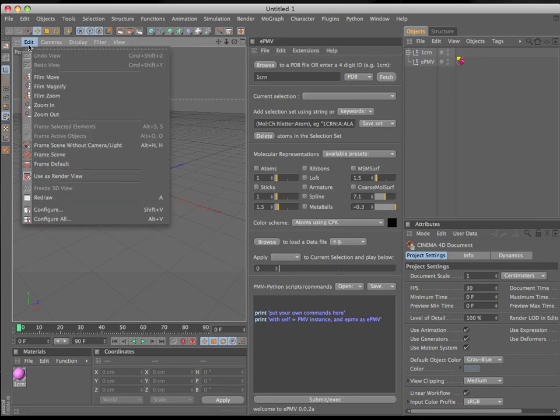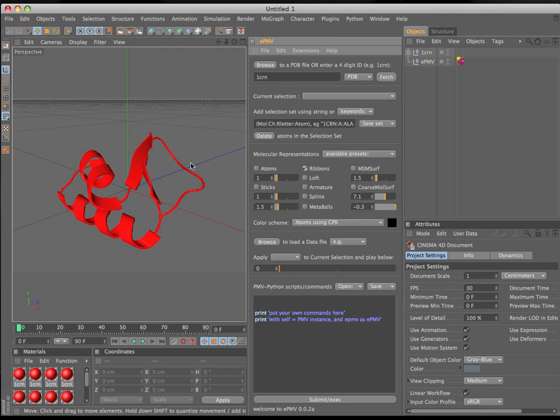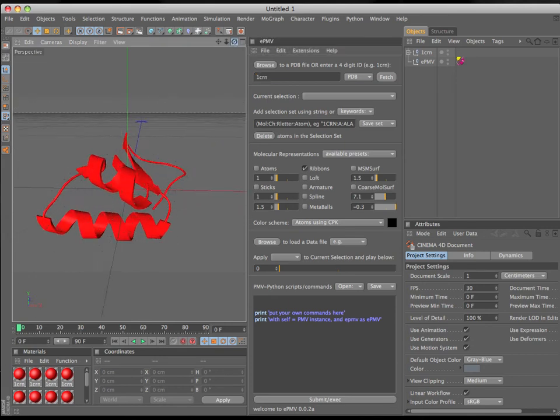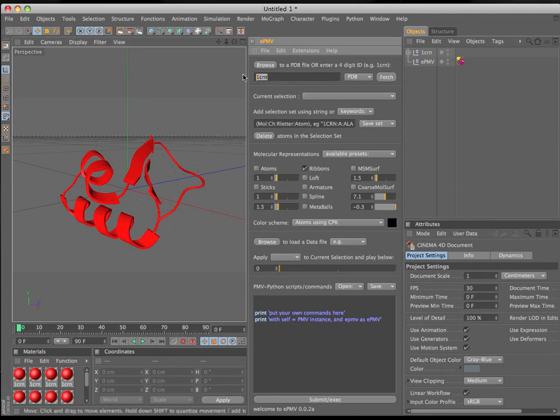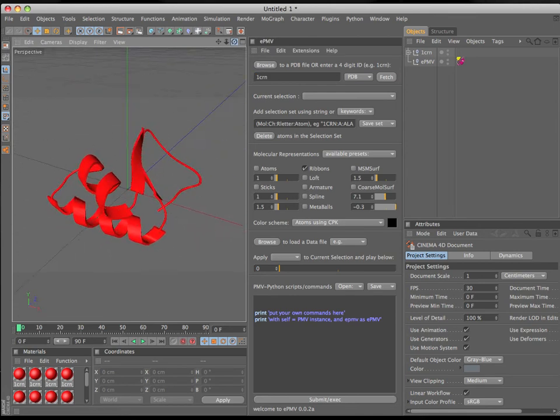On Cinema 4D, I'm going to say Frame Scene. You can probably not make this out on YouTube, but there's a bunch of little black dots here. If I roll down and click Ribbons, I'll see each one of those dots represents the position of an atom. This file, 1CRN, is a protein database file — the four-digit alphanumeric code for that particular crystallographic representation of that protein.